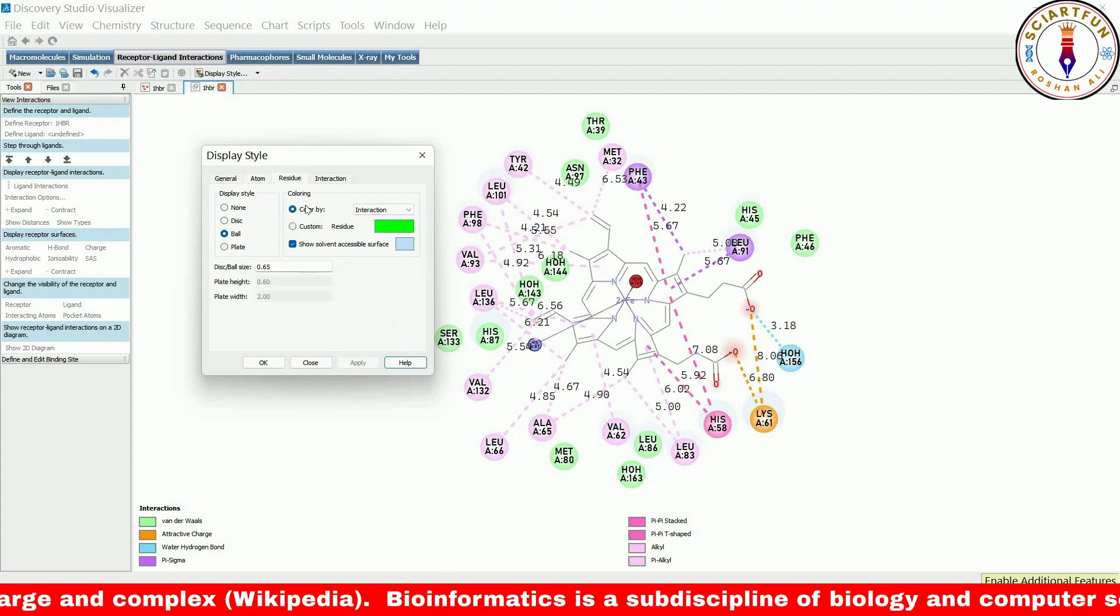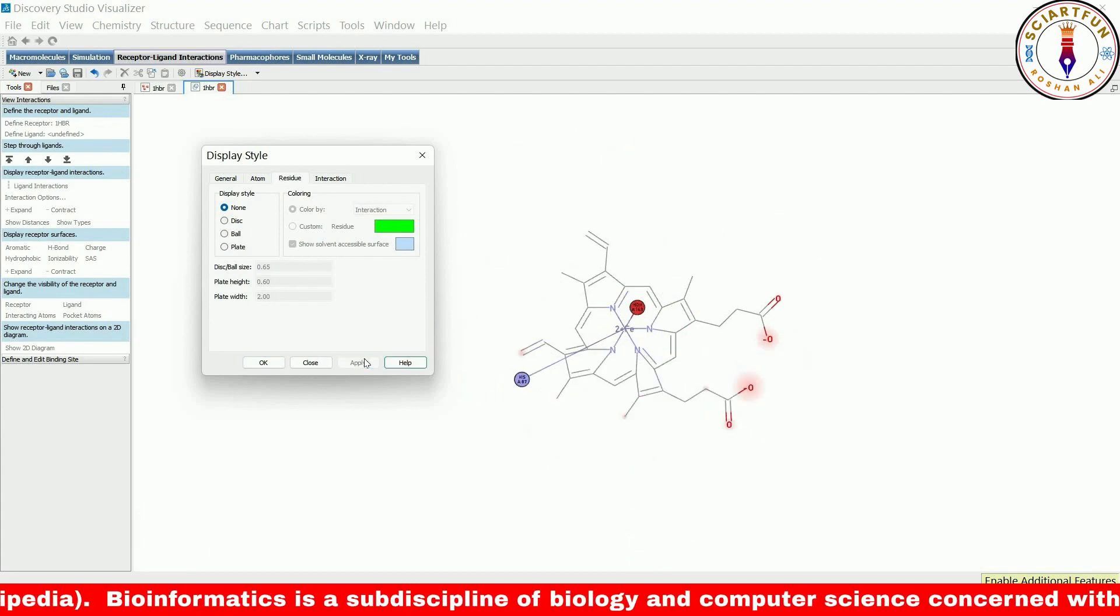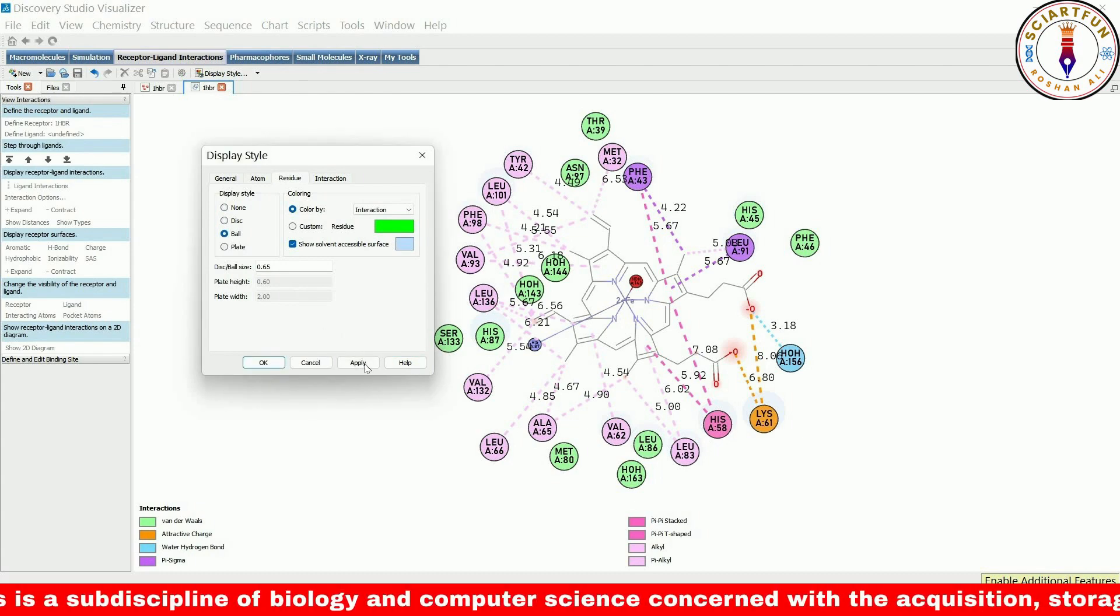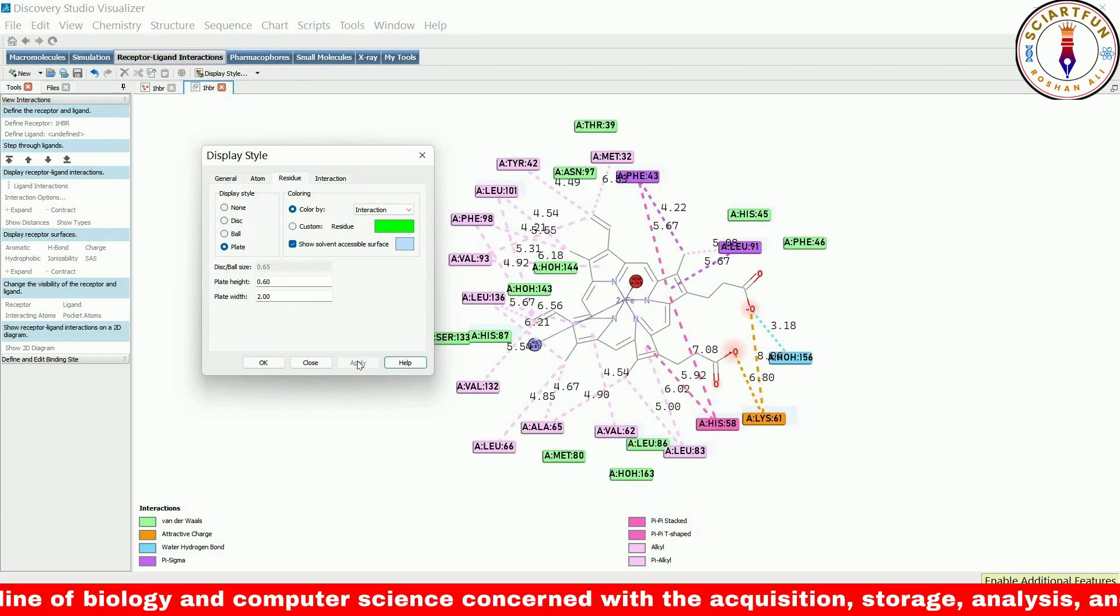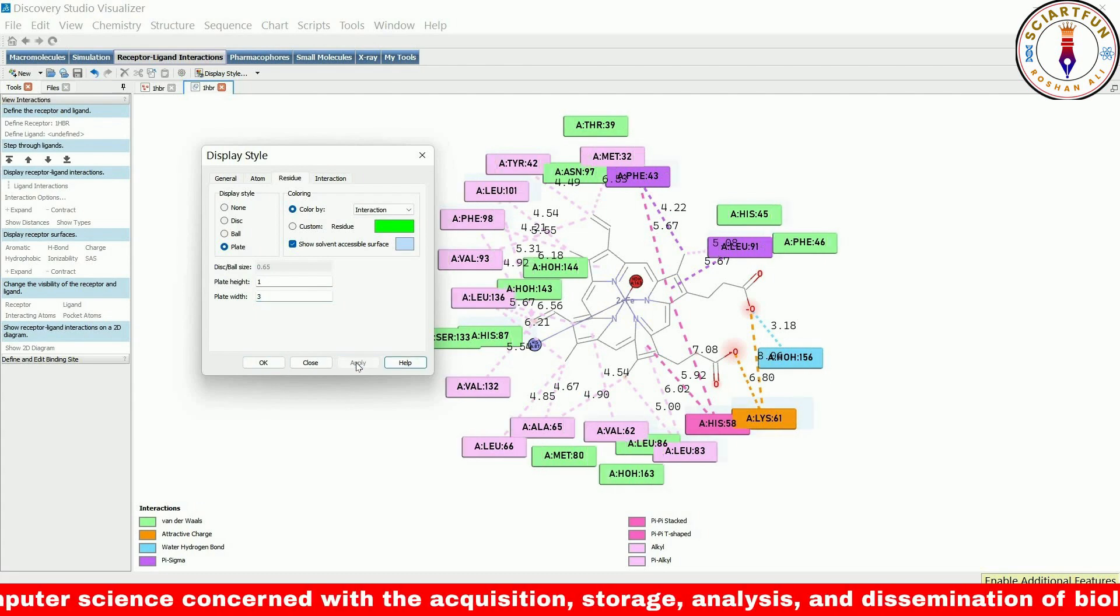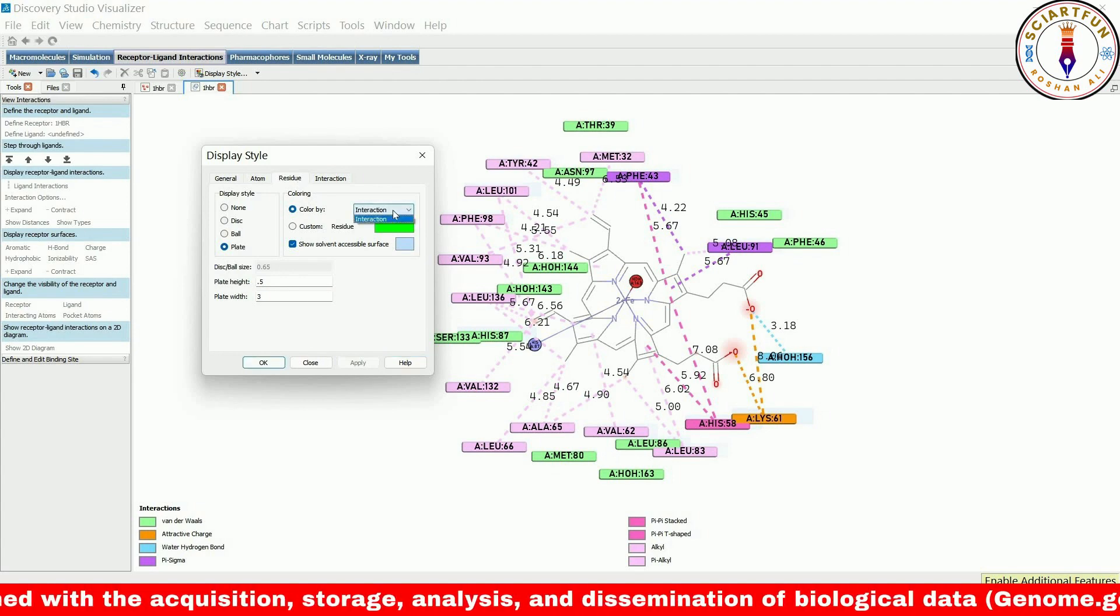In the residues tab, we can control the appearance of the residues that are making interactions with the ligand. We have options to display them as none, disc, ball, or plate. We can also change the width and length of the plates and control the color of the residues.